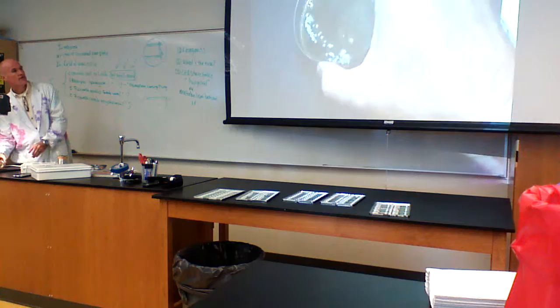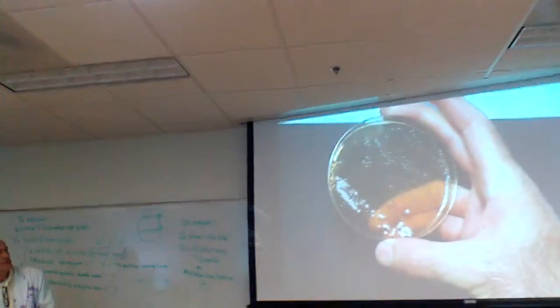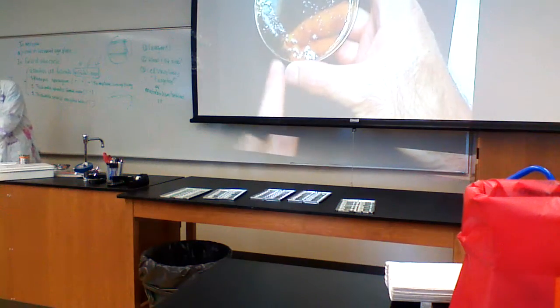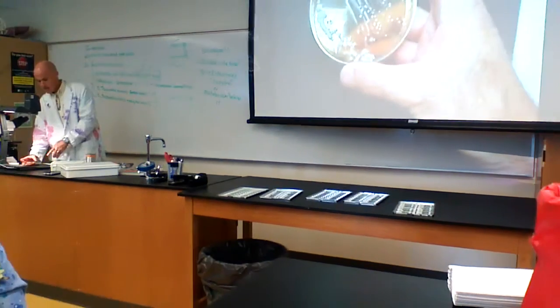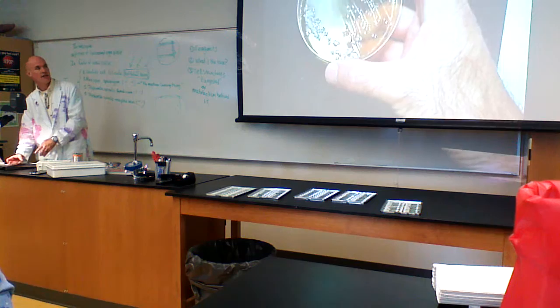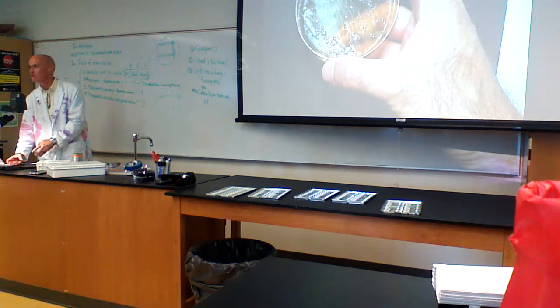Okay. Right. So you can see those little pale colonies and that little fungus that I'm hoping is cordyceps. Both of the things on there are fungus? The white one? Honestly, I think this is a fungus because I can see it's thready. The translucent ones, some fungi can actually be single cell and will grow in colony form and don't form hairs.